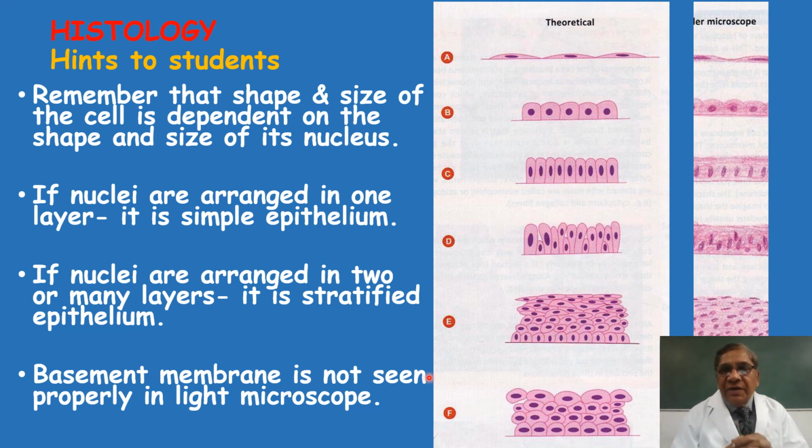The basic guide for you will be the shape and size of the nucleus, according to which you will ultimately imagine the shape and size of the epithelium.